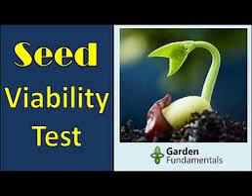Brick gravel test. Hiltner test. Hiltner developed this test in 1917. From the experiment, he concluded that seeds still affected with Fusarium were able to germinate in a regular test but could not emerge through brick gravel of 2 to 3 mm size. However, healthy seeds were able to emerge. The brick gravel test is based on the principle that weak seedlings are not able to generate enough force to overcome the pressure of brick gravel. Perry, 1984, established that the method is reproducible and associated with field emergence in the case of wheat and other cereal crops.